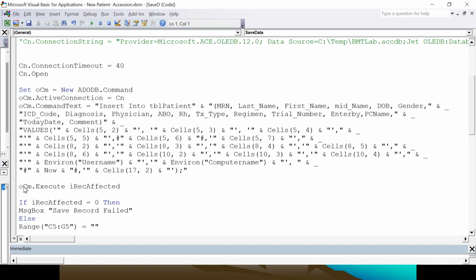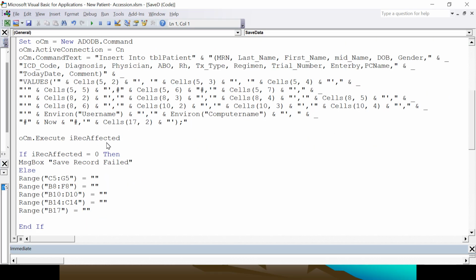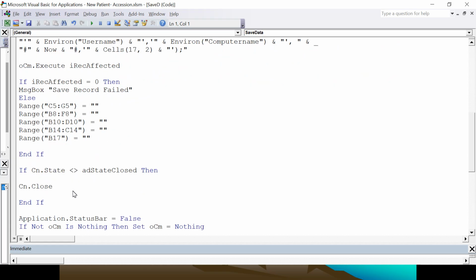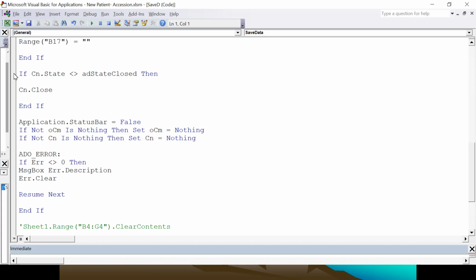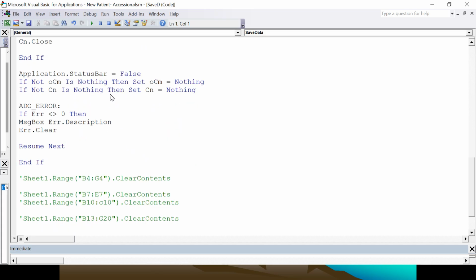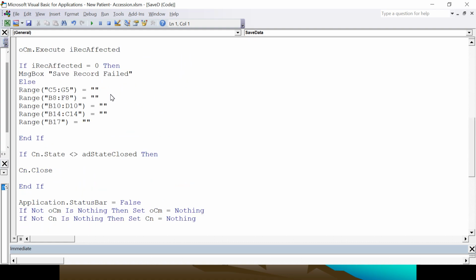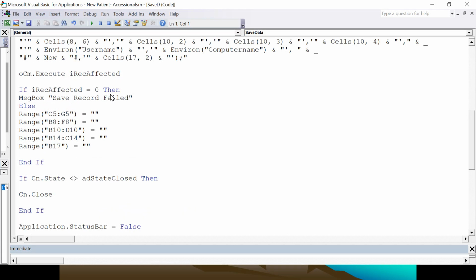So this is the save data check. If the check fails, it tells you. If it successfully saved, all the contents I showed you will be cleared, which makes it easy to show the data was saved. Then this jumps to close the loop. So that's closing the collection and clearing the data type. That's just like this. So this is the save data.